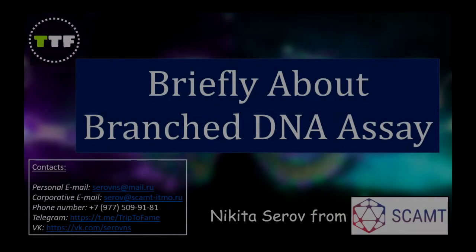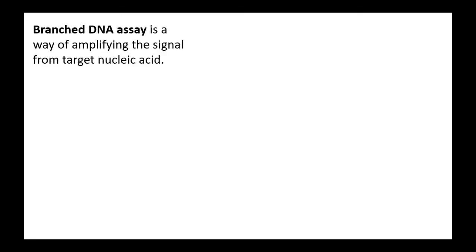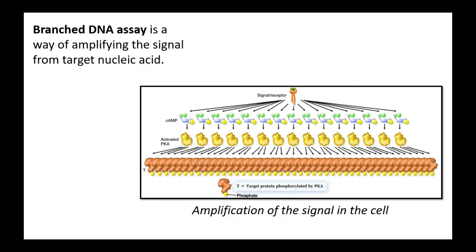Several ways of detecting nucleic acids exist, and branched DNA assay is one of them. This technique amplifies the signal in a very interesting fashion. The idea is very simple. Let's suppose you want to detect some mRNA with a known sequence. What would you offer to amplify the signal from a single mRNA molecule?